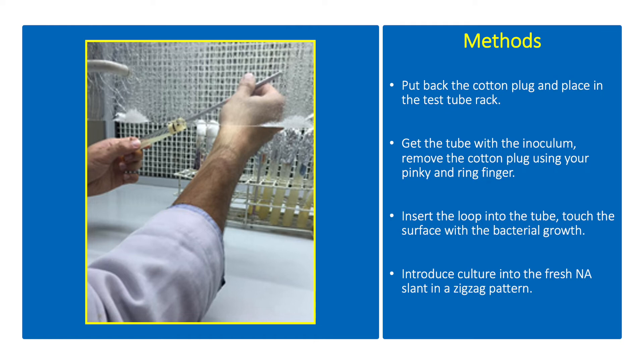Get the tube with the inoculum. Remove the cotton plug using your pinky and ring finger. Insert the loop into the tube and touch the surface with the bacterial growth. Inoculate the culture into a fresh NA slant in a zigzag pattern.